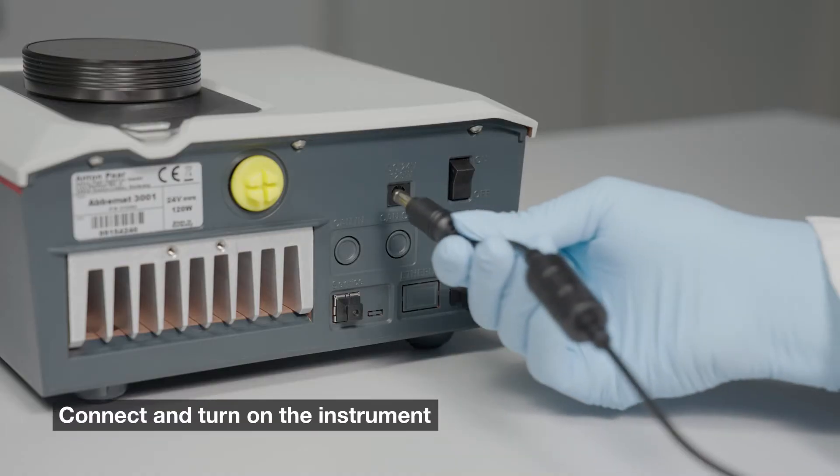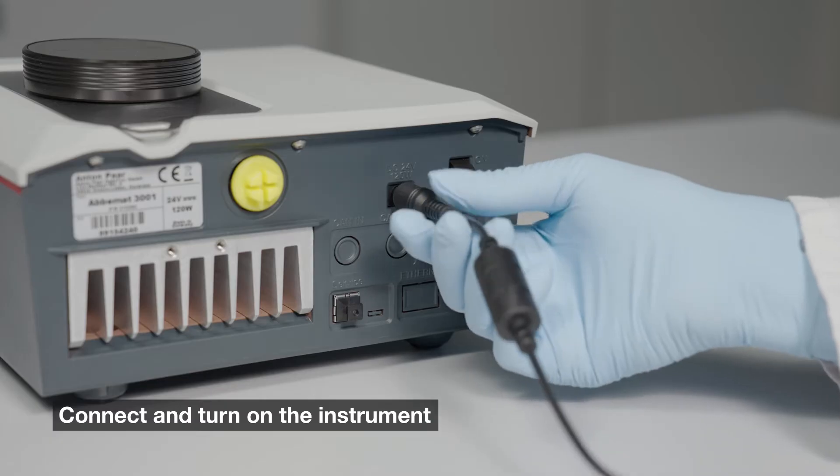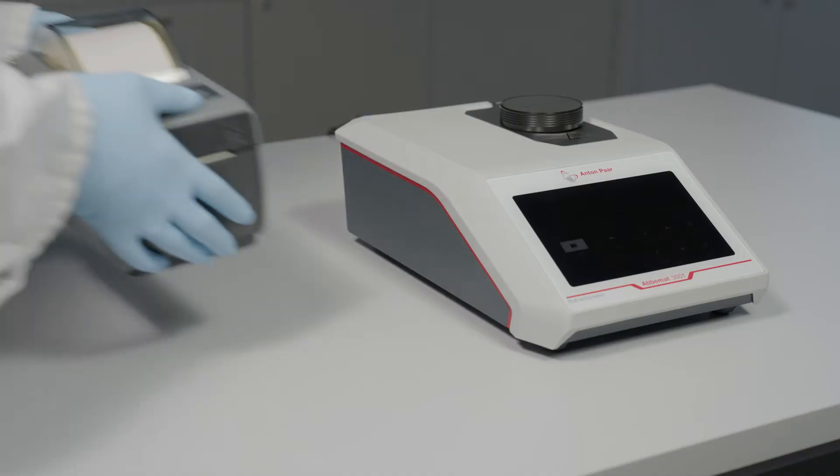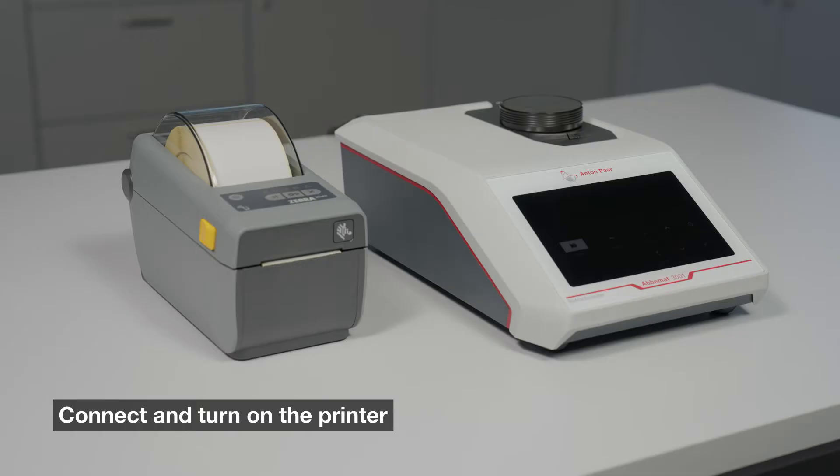Connect the external power supply to the instrument and plug the power supply into a mains outlet. Ensure the power switch on the rear of the instrument is off while connecting. Connect and turn on the optional label printer.